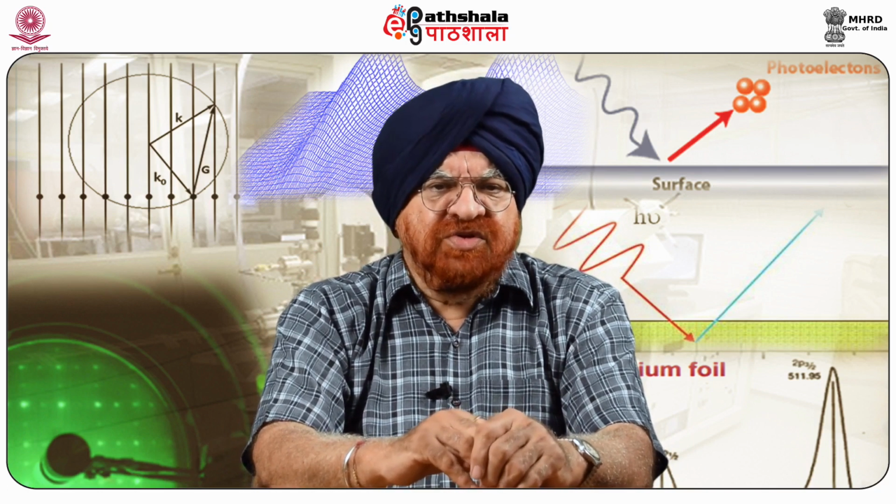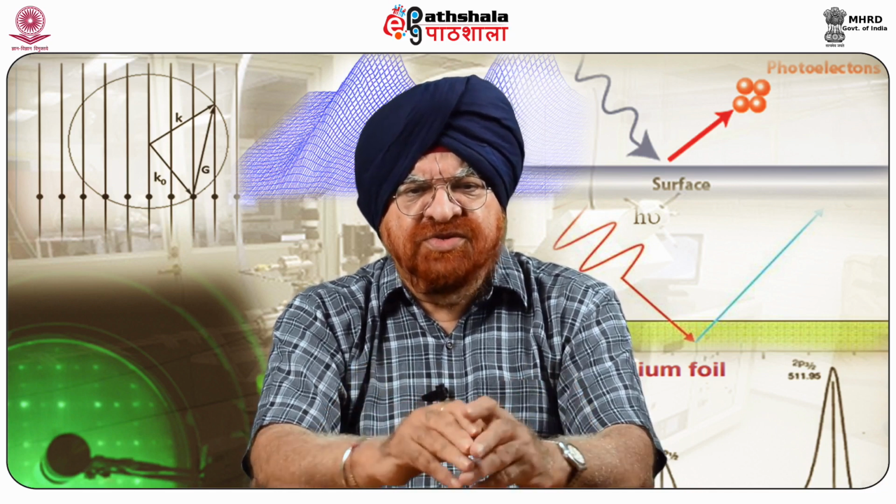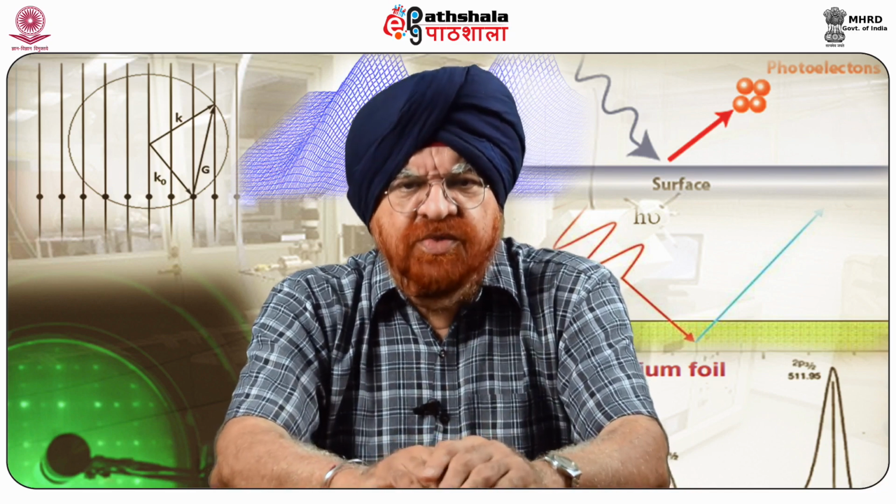Now, chemical force imaging can be done with the help of chemical sensing or chemically sensitive imaging. AFM probe tips are covered by particular chemical functional groups.